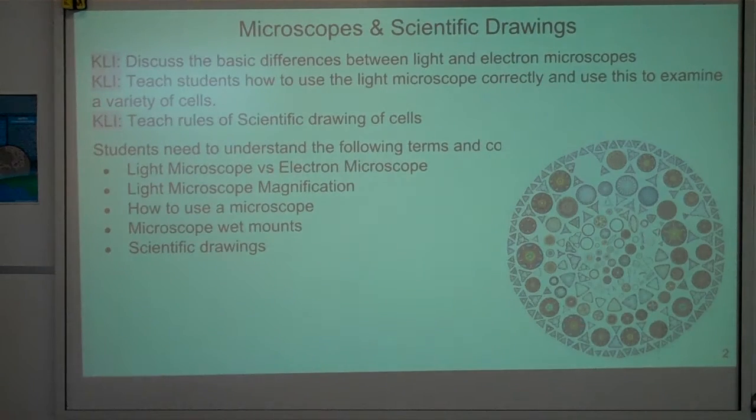Key learning intentions. What is the difference between light microscopes and electron microscopes? You won't get to use an electron microscope. The university has them, but we do not. Teach students how to use a light microscope. We've done some work with that already. Teach students the rules of scientific drawing. You're already pretty familiar with those based upon our podcast.